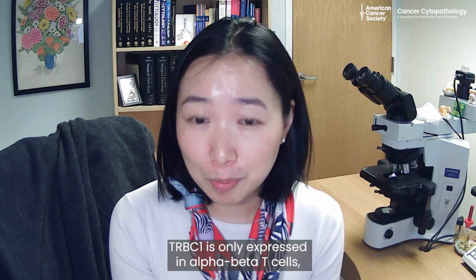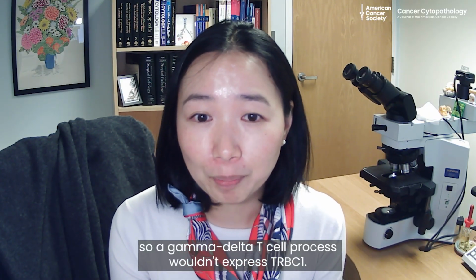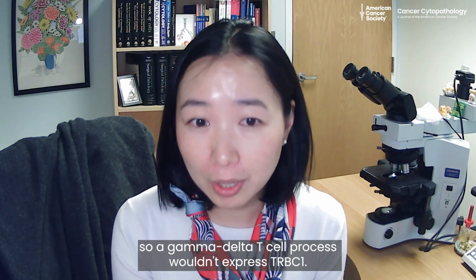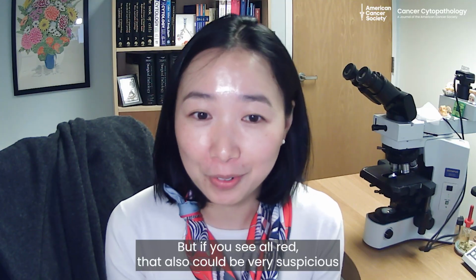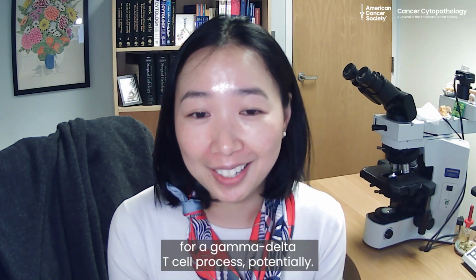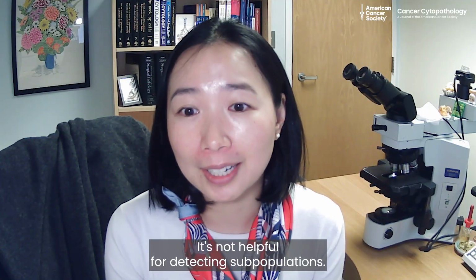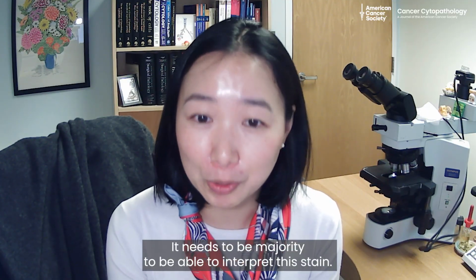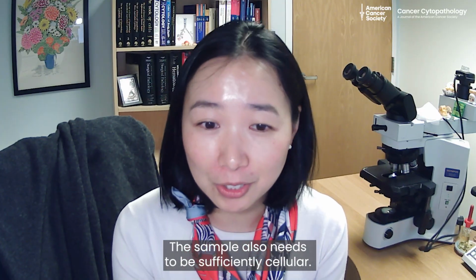TRBC1 is only expressed in alpha beta T cells, so a gamma delta T cell process wouldn't express TRBC1, but if you see all red, that also could be very suspicious for a gamma delta T cell process potentially. It's not helpful for detecting subpopulations. It needs to be majority to be able to interpret the stain. The sample also needs to be sufficiently cellular.